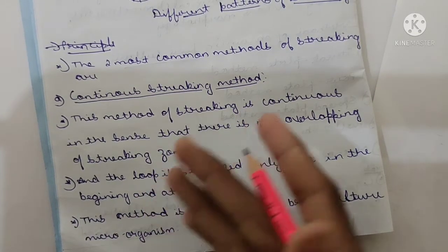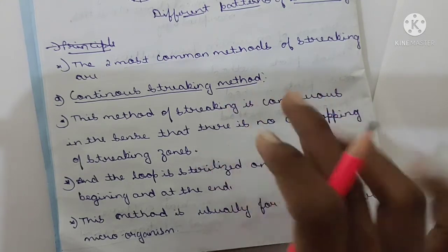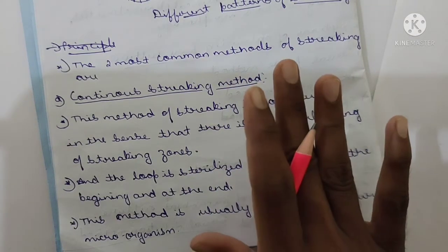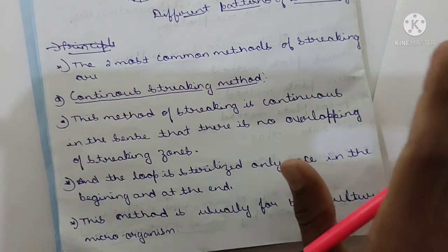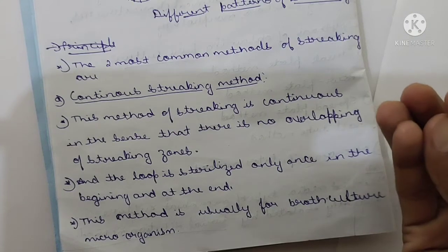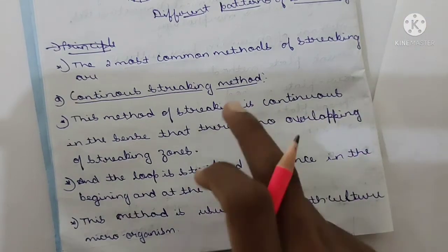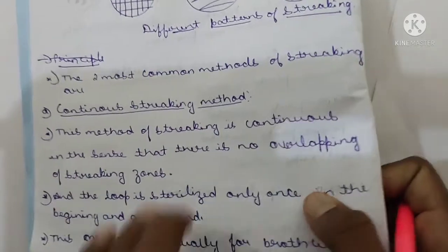Broth culture, you remember, is a type of culture in which the culture is developed in such a manner that we are providing different types of nutrition for that culture. It's nothing but broth culture. Culture means it is a shelter for the microorganisms. For example, it is a home in which different varieties of nutrients are present. This is nothing but broth culture, and this method is specially for the broth culture.